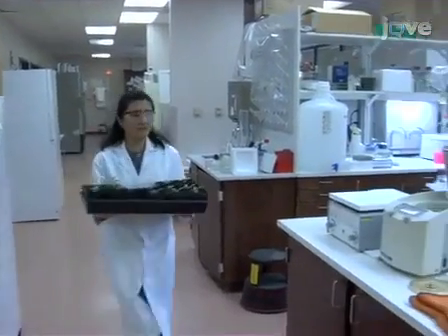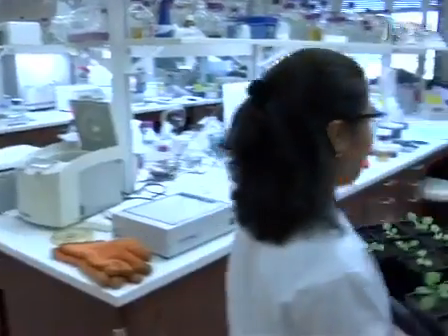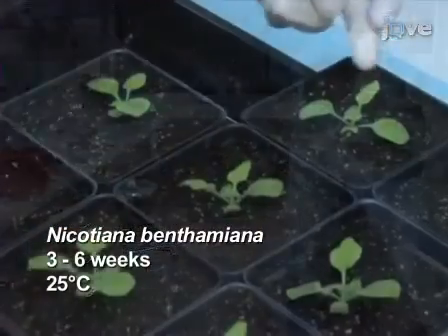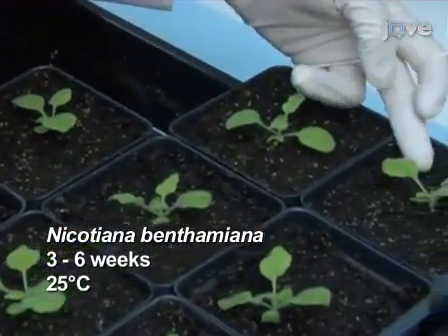Infiltration requires fully expanded healthy leaves of 3 to 6 week old Nicotiana benthamiana plants grown at 25 degrees Celsius. Plan to carry out this protocol over 8 days.